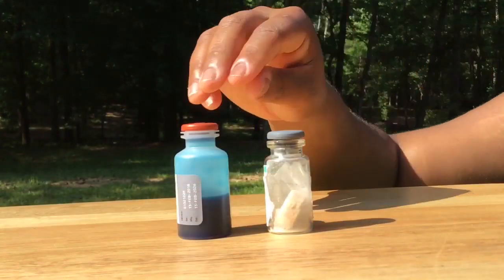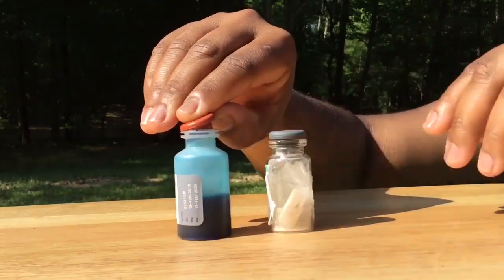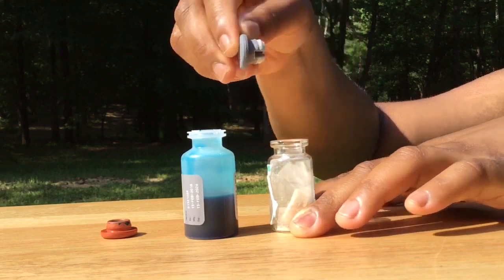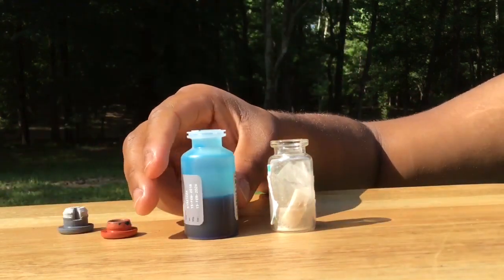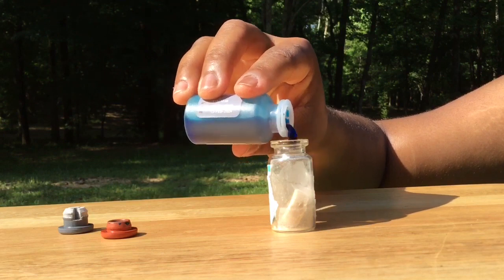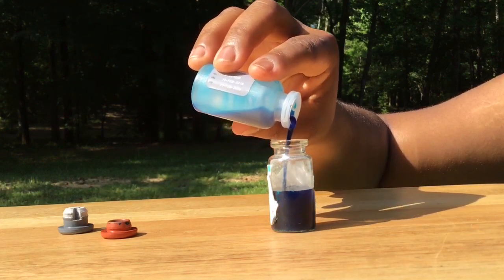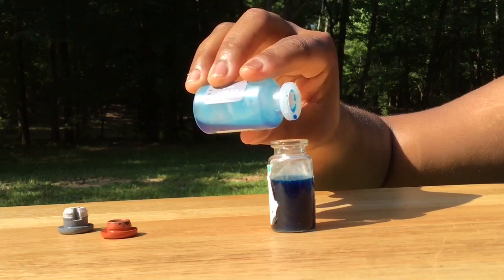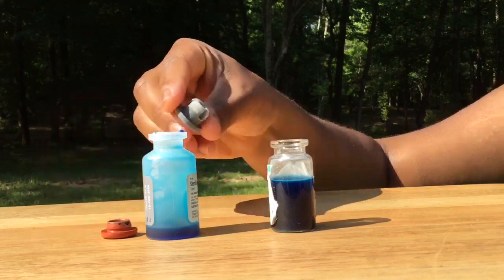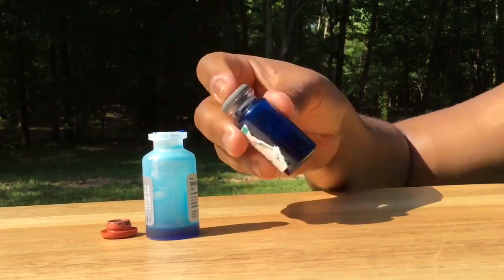To mix your vaccine, carefully take the lid off the diluent bottle as well as the vaccine bottle. Next, pour the diluent into the vaccine bottle. Here you will see the vaccine dissolve into the diluent. Put the lid back onto the vaccine bottle and shake the vaccine bottle for the length of time listed in the instructions provided with your particular vaccine.